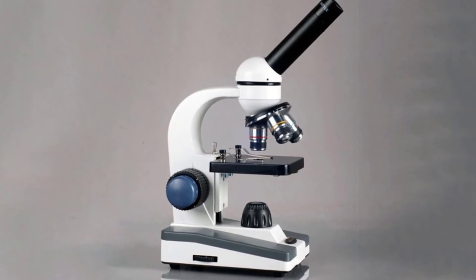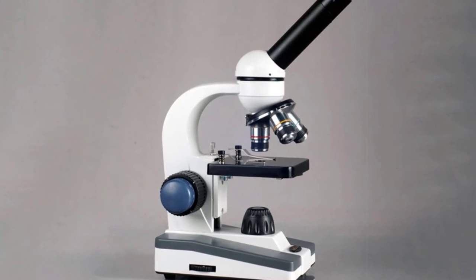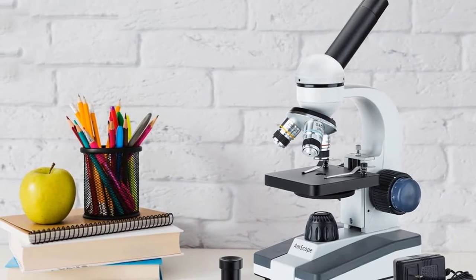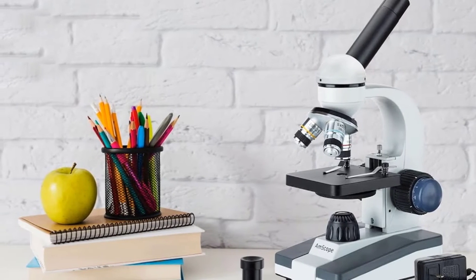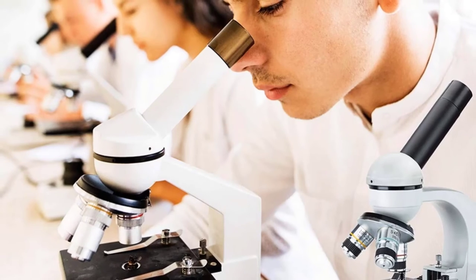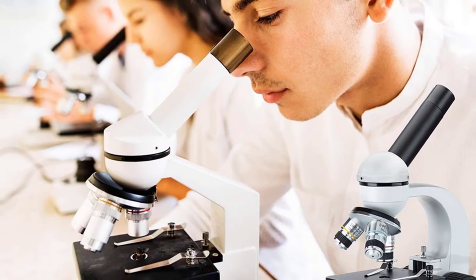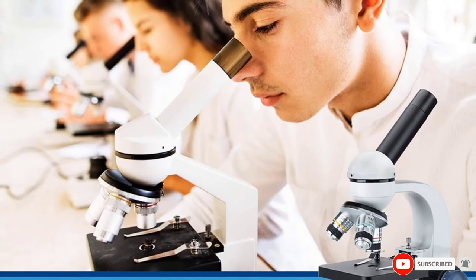If you prefer teaching your kids at home with a great mix of quality and durability, this compound microscope might be something you need when homeschooling. Emscope included fine and coarse knobs in this rendition, helping users refine the magnified object. The only downside of this machine is the lack of dual LED, but has one from under the stage and accessories. Nevertheless, one of the best microscopes for kids out there.